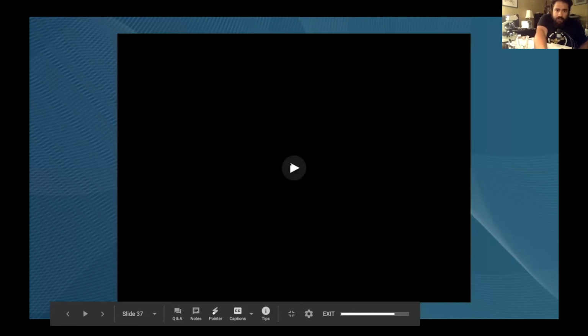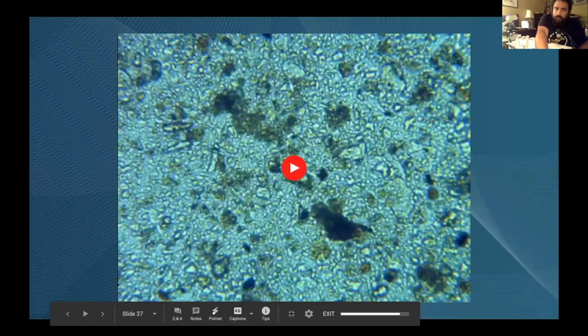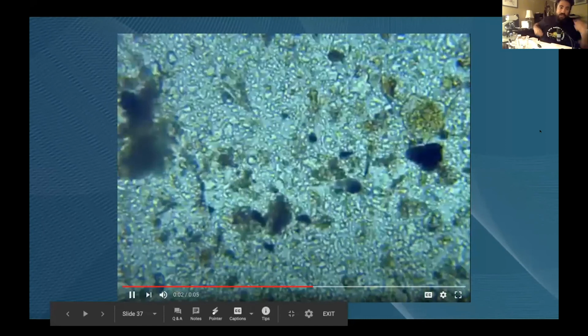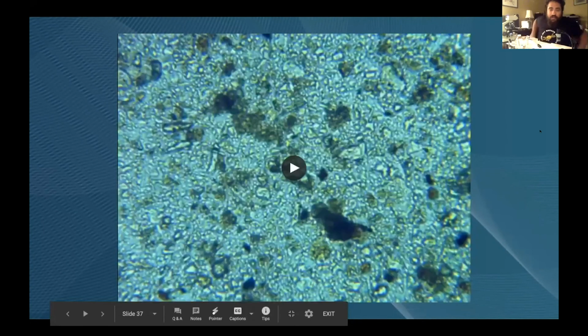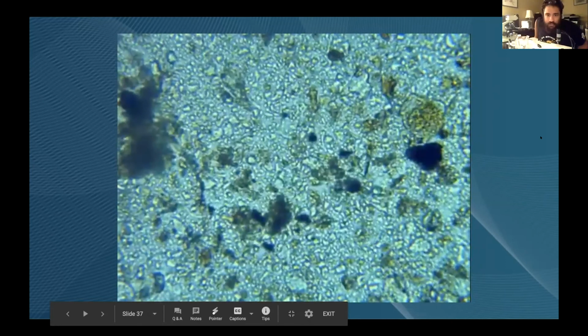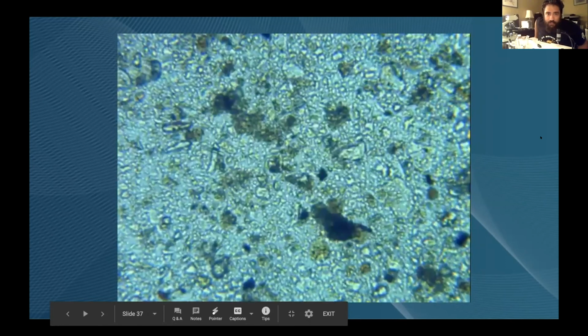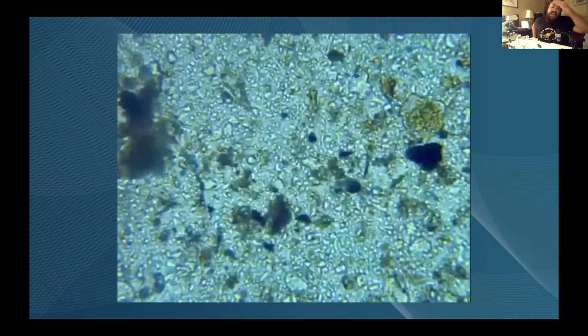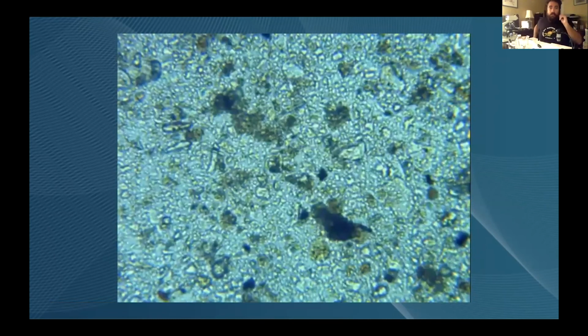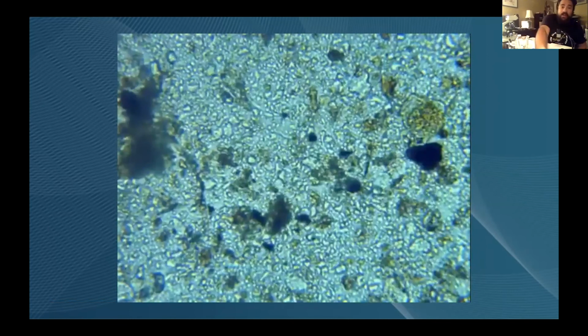All right, so this was the photo that I showed you before. We can see here this is a really compacted soil. See how it's gyrating and vibrating back and forth? I'm trying to put it on a loop so everyone can see it. But you can see the bacteria pulsing and moving around between the parent material and the organic material. This is actually from Manhattan Avenue Park in Greenpoint. So this would be a disturbed soil, ecological disturbance, where bacteria are far more prominent in general.